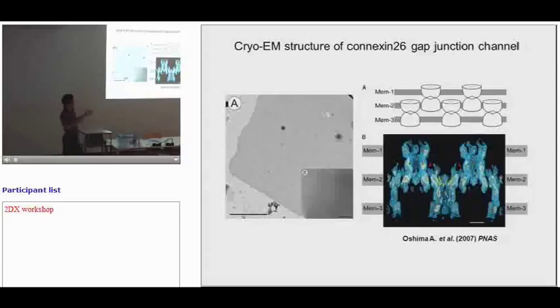And the 3D map reveals that the structure in membrane 2 is a bit different from the structure of protein in membrane 1 and membrane 3. Supposedly, this is because of the specimen drying and/or mechanical contact with carbon film.